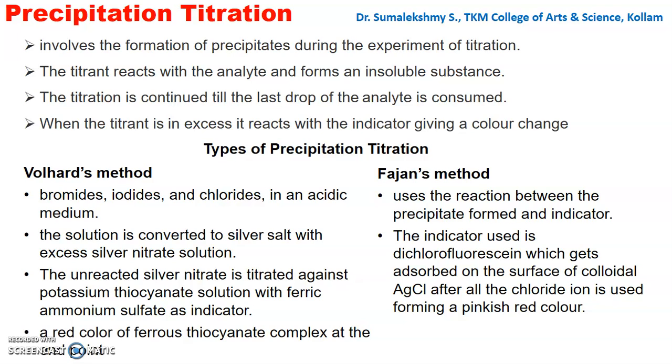We will move on to precipitation titration. Precipitation titration involves the formation of precipitates during the titration. The burette solution is added to the conical flask, forms an insoluble precipitate, and the titration is continued till the last drop of the analyte is consumed.